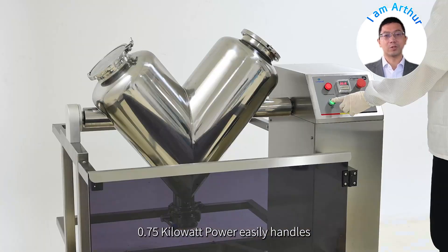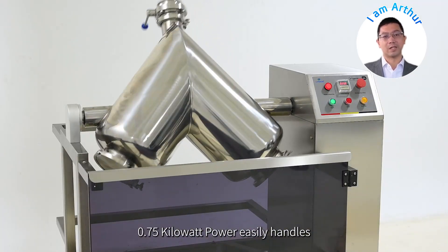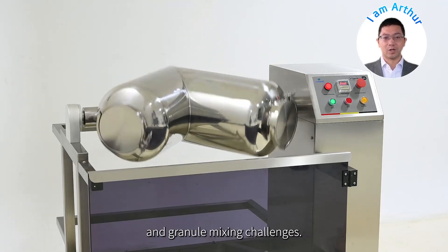36 RPM, 0.75 kW power, easily handles various dry powder and granule mixing challenges.